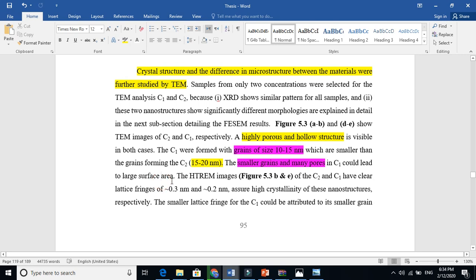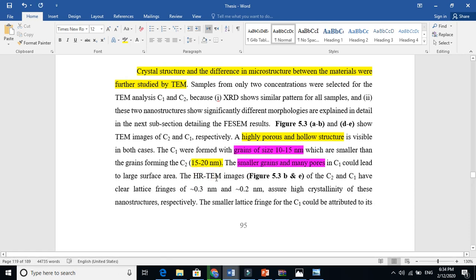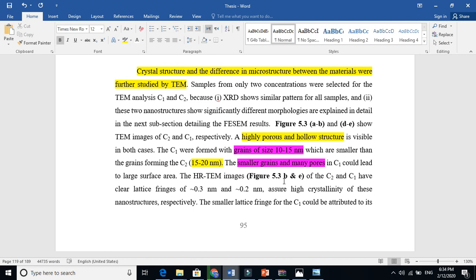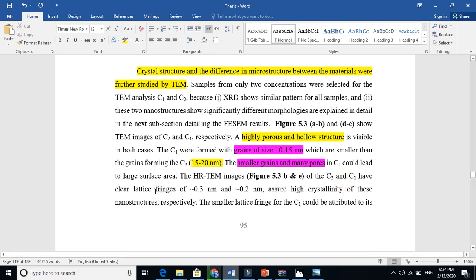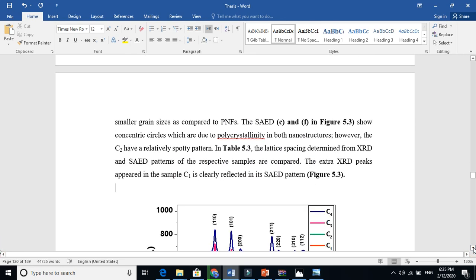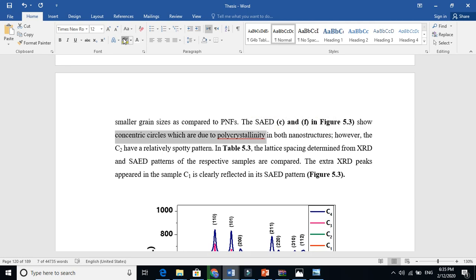If we have smaller grains and more pores, it increases the surface area. The high-resolution transmission electron microscope (HRTEM) images — that is at very high magnification — allow us to see that the lattice d-spacing between two planes was measured, assuring high crystallinity of the nanostructure. Finally, the selected area electron diffraction (SAED) pattern shows concentric circles, which confirms the polycrystalline nature of the material. Both concentrations are polycrystalline in nature.